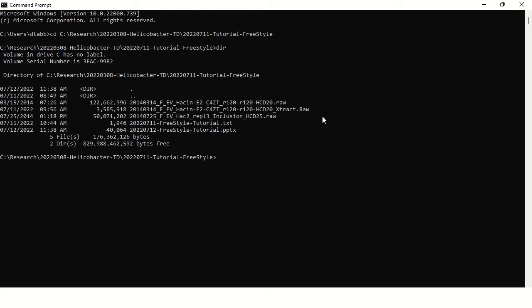But remember that we're not ready to do our deconvolution yet because I want to learn something about what precursor ions were specified for assessment in these experiments. Now for this, I need to tell the software where to find ProteoWizard. And I've installed it inside program files. I hit Tab to do autocomplete there.